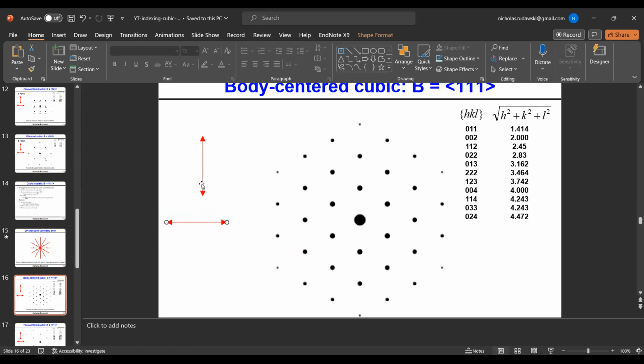by, so it doesn't really matter which G vector you make the longer one or the shorter one. You should end up with the same answer. I tend to prefer to make G1 the shorter vector, and I tend to prefer to make G2 the longer one.